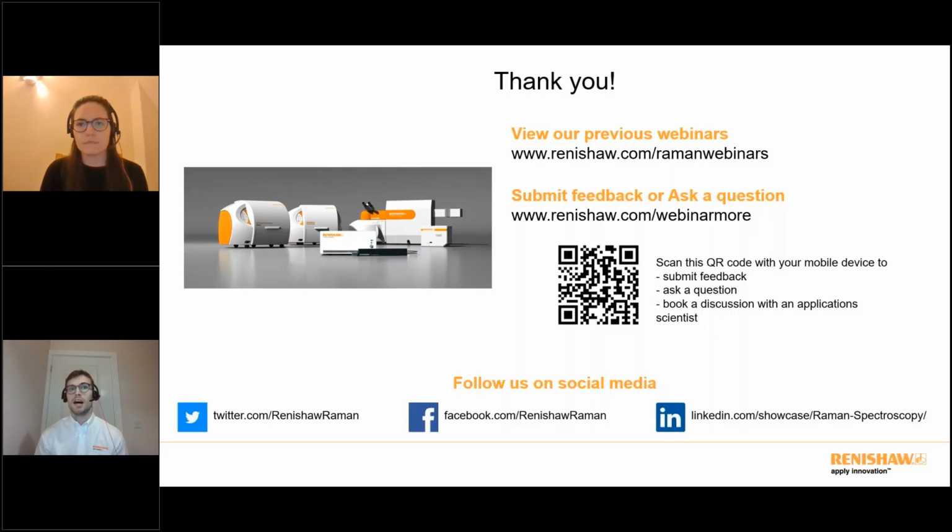This is a faster way and a more unsupervised way of collecting our data. Then at the other end of the model building process, we can apply our built model to map data as well. This will assign each of the pixels to one of our different classification groups. So this is a nice way that we can, for example, identify something like a tumour boundary. Something to keep in mind if you want to make your data collection a little bit more automated.